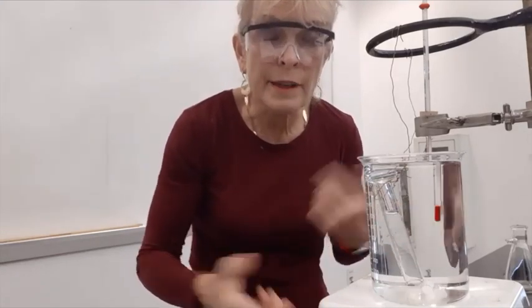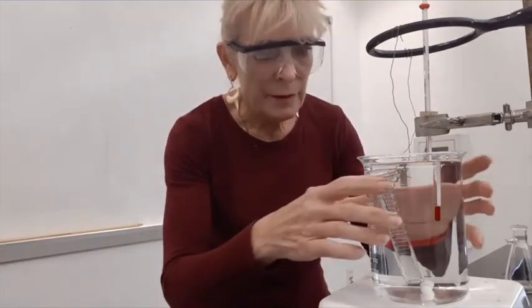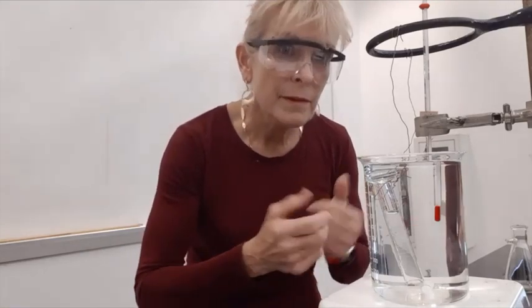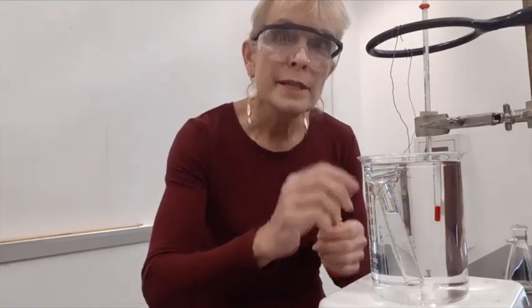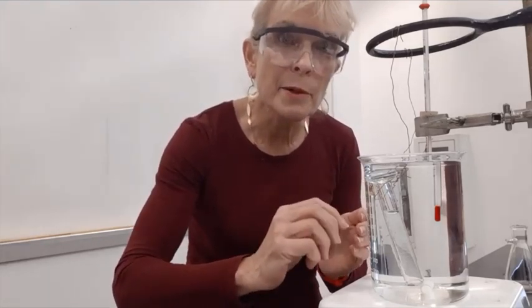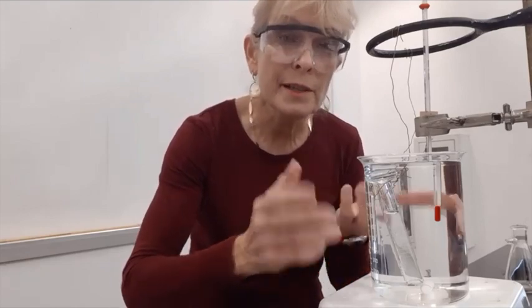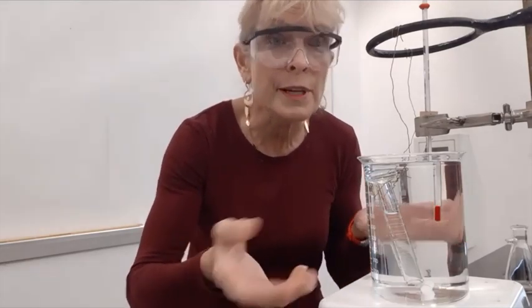What we do now is turn on the heat so that the water surrounding the little graduated cylinder heats up to about 70 degrees. As the water heats up, the amount of water vapor in the bubble also increases, because the vapor pressure of water increases with temperature.